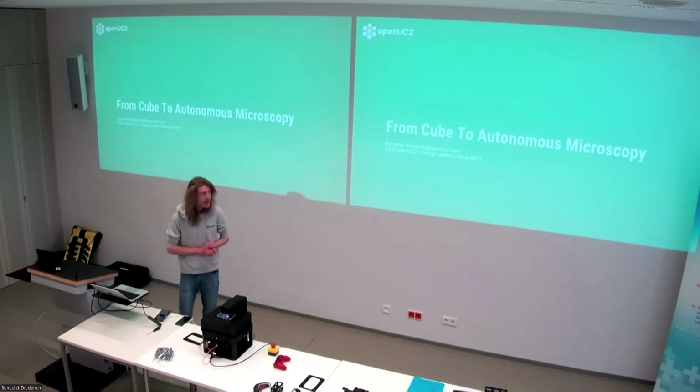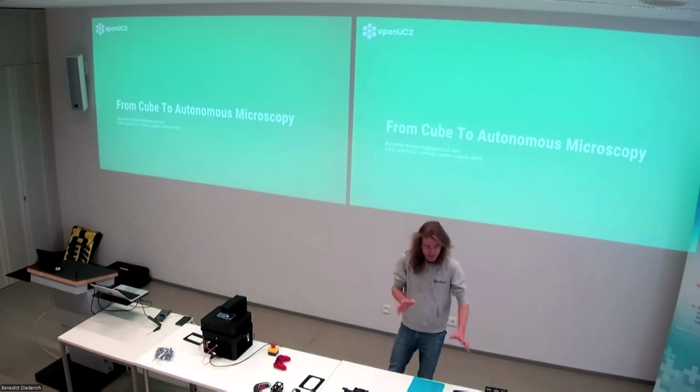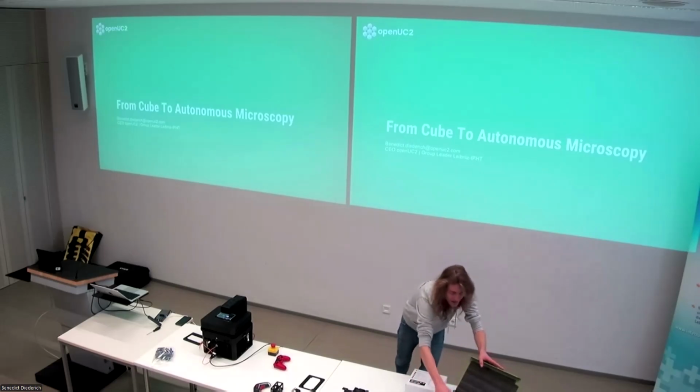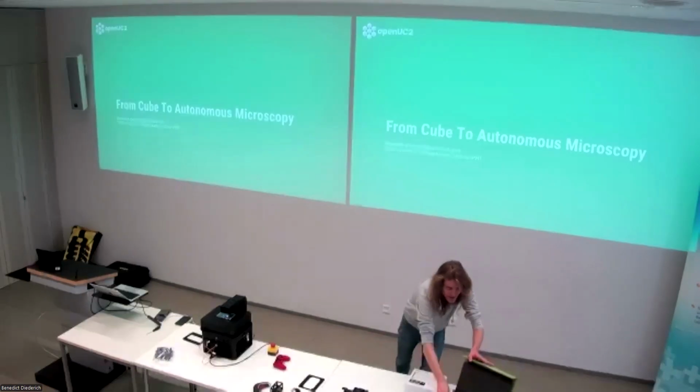After this little talk, we will guide you through the steps of how you go from simple cubes, from the different boxes we have mostly for teaching. I'll tell you why we have these cubes, to eventually make bigger cubes, and then learn how you integrate these cubes into this fully autonomous microscope. And for this, I will share my slides. And it will be interactive.